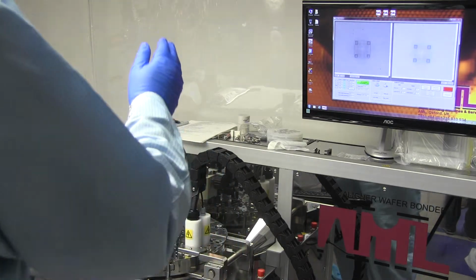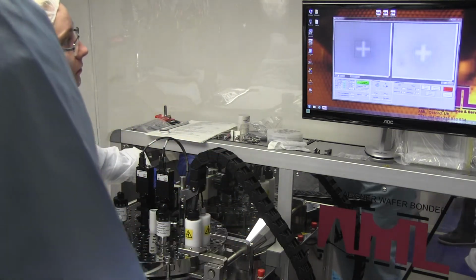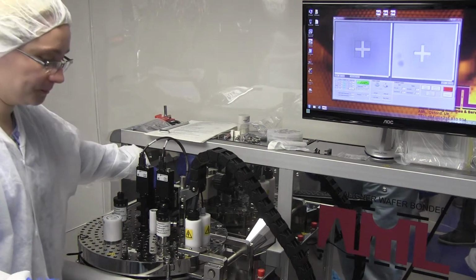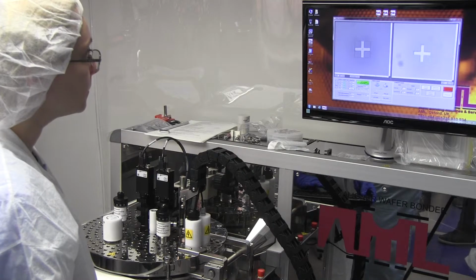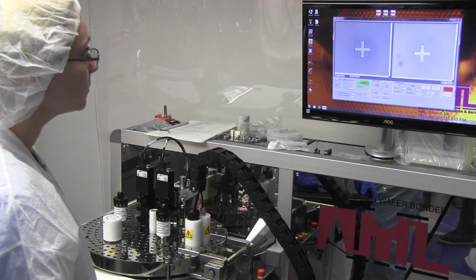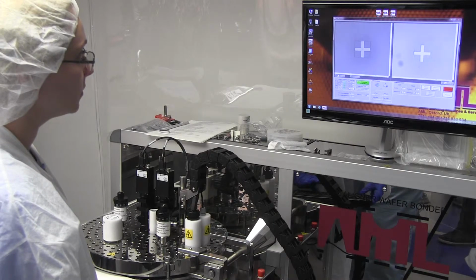So now if you focus back to the upper wafer, you can move the Z drive up and actually have a look at both of them focused simultaneously. So in theory, they should still be within the square. Is it just this one? Just up, yeah, with no spacebar.